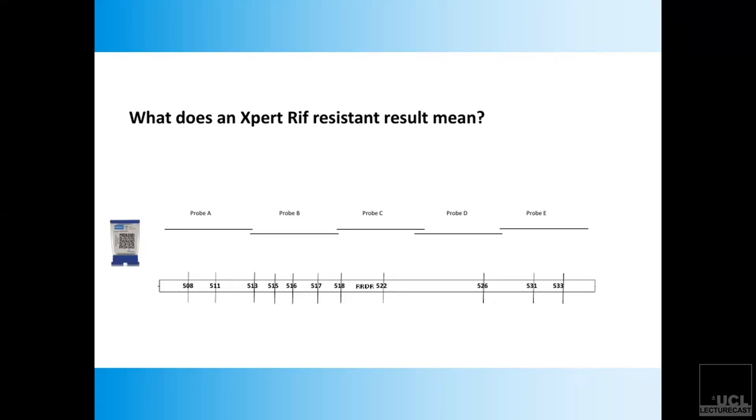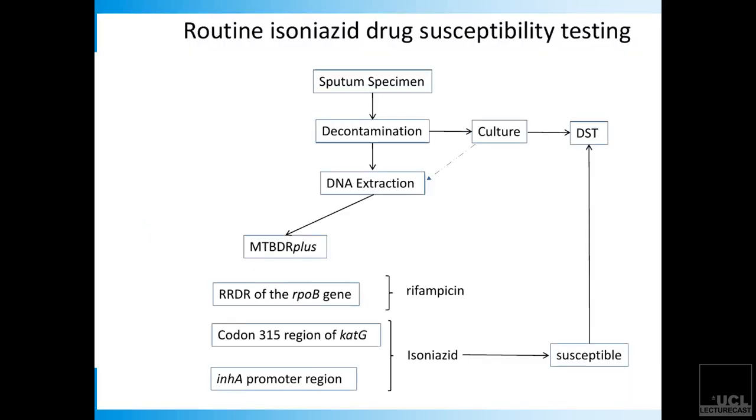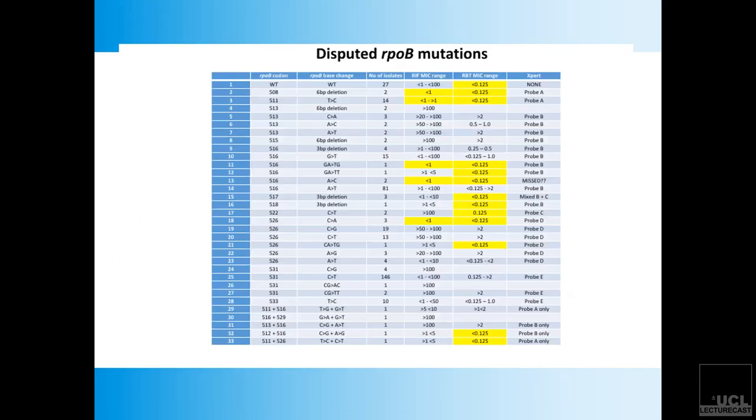It's a conventional PCR. Okay. Yeah, it's a conventional PCR underlying probe. And then you just see whether your sample is complementary to either the wild type or the mutant.